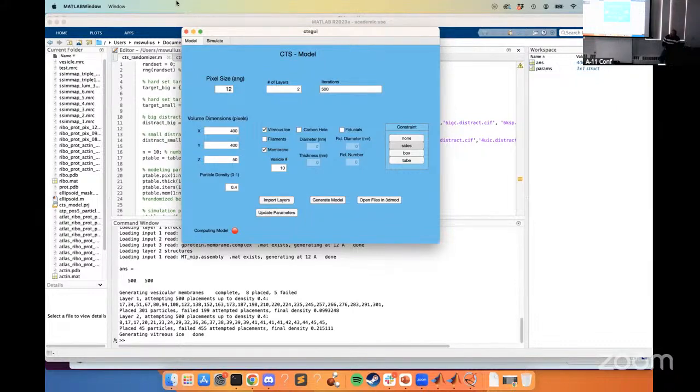So could you also clean up what a different software made in Dragonfly? You mean a segmentation from another software? Probably, if you can open it, because if you can open it as a grayscale image, then you should be able to extract in Dragonfly all of the regions of interest based on what the grayscale values are. And then you would have something to work with there. I've never done it, but I'm certainly willing to try.